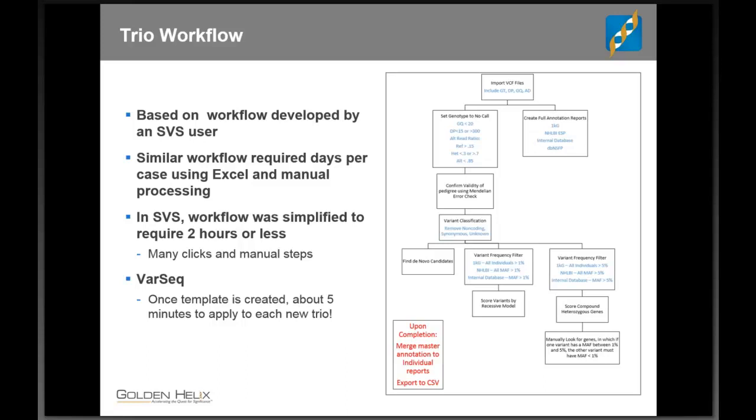With exome analysis, you don't necessarily know what you're looking for as you get started. You have a much larger search space to work with. As a result of that, the workflow that you pursue becomes very important. The set of assumptions that you make about how the causal variant might present itself are very, very important, of course.